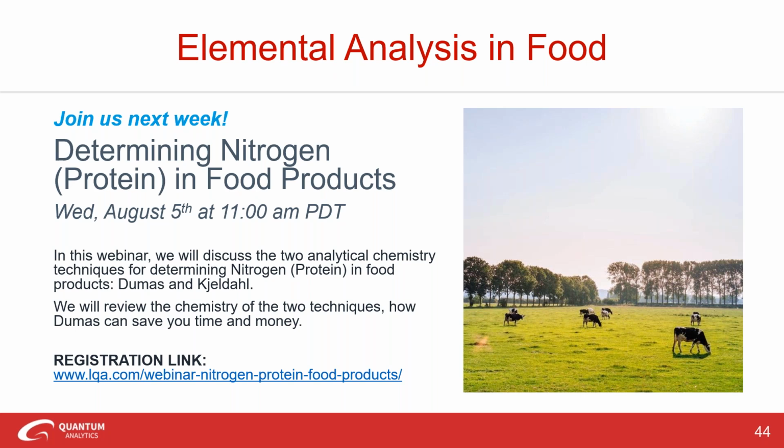Fantastic. The next question is, is there any validation that shows the XRF method can bring the same accuracy and precision that an AAS or ICP method can achieve? So accuracy and precision, again, comes down to the limits of detection that you want to analyze for. Those are more sensitive techniques, right? So those are more applicable to trace level analysis. But those have their own inherent errors as well, right?